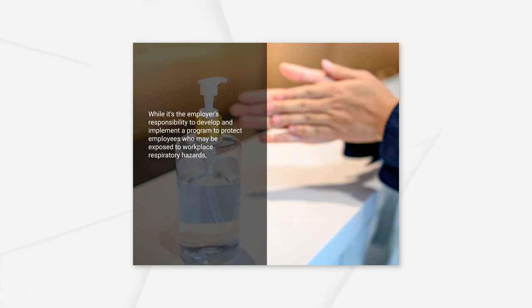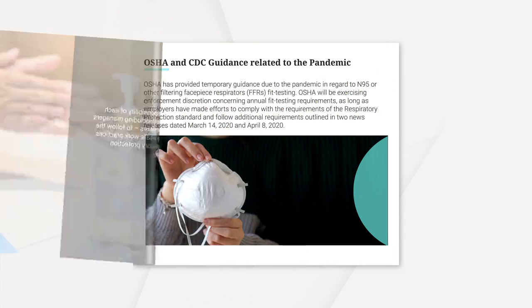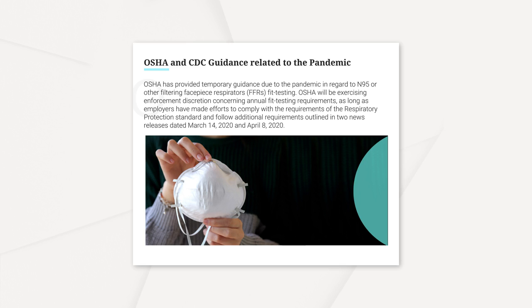While it's the employer's responsibility to develop and implement a program to protect employees who may be exposed to workplace respiratory hazards, it's the responsibility of each employee, including managers and supervisors, to follow the company's safe work practices and respiratory protection procedures. OSHA has provided temporary guidance due to the pandemic in regard to N95 or other filtering facepiece respirators, FFRs, fit testing.